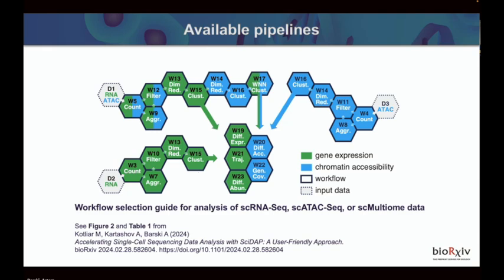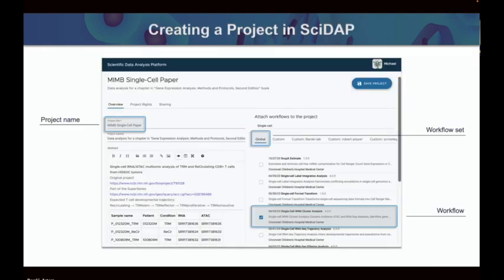We have a table with the pipelines in the preprint, which you can use to select the pipelines you need.